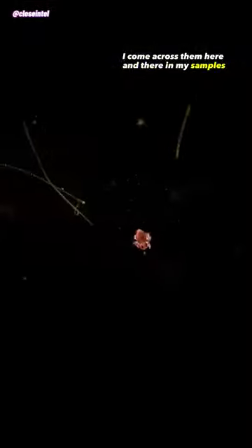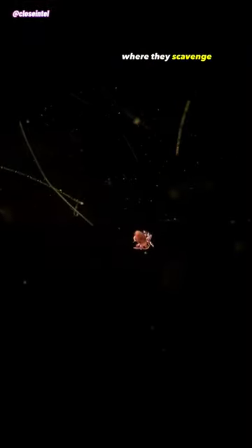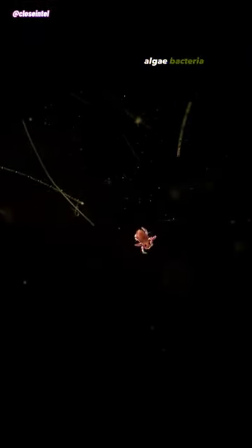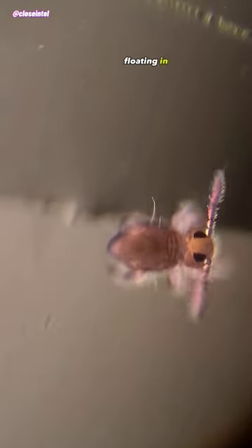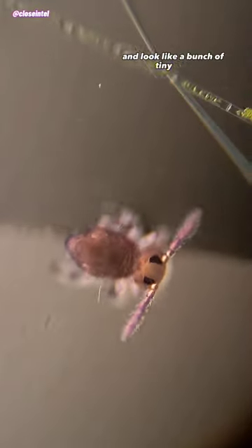I come across them here and there in my samples on the surface of the water, where they scavenge for dead organic matter, algae, bacteria, and even fungal foods like mold and mildew. In their natural habitat you can usually find them huddled together floating in large groups, and they look like a bunch of tiny dots.